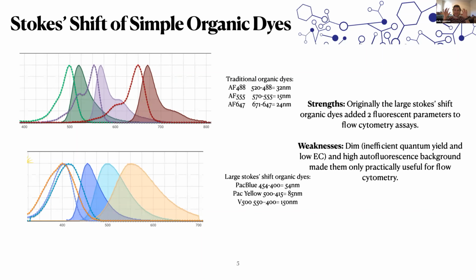and they start to resonate that energy and they start vibrating, and they have different side chains on that molecule that can rotate or shift. All of that energy, that dissipation of heat and vibration, is going to create that Stokes shift with that loss of energy. So it kind of inherently means it's never going to make the fluor brighter or more efficient by having a longer Stokes shift. That's why we have to rely on FRET to do it.